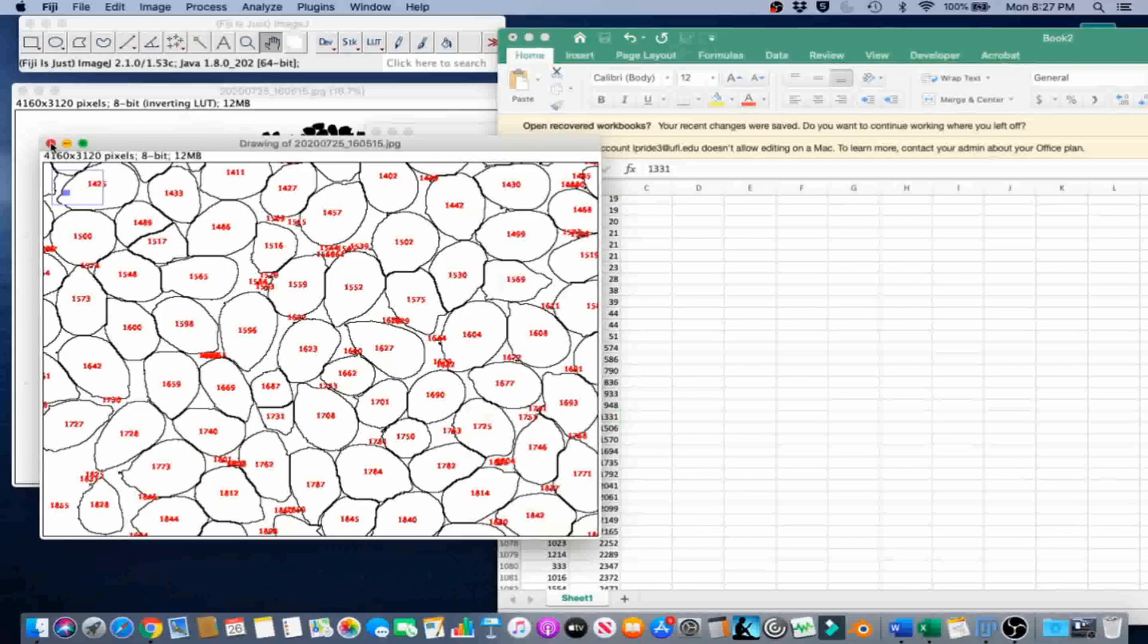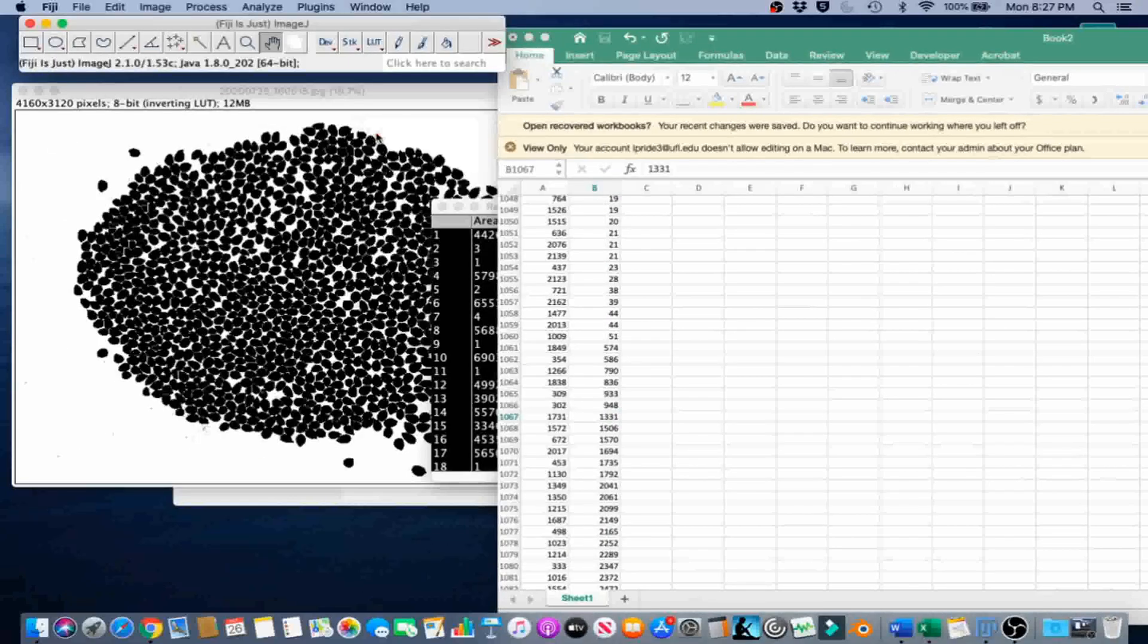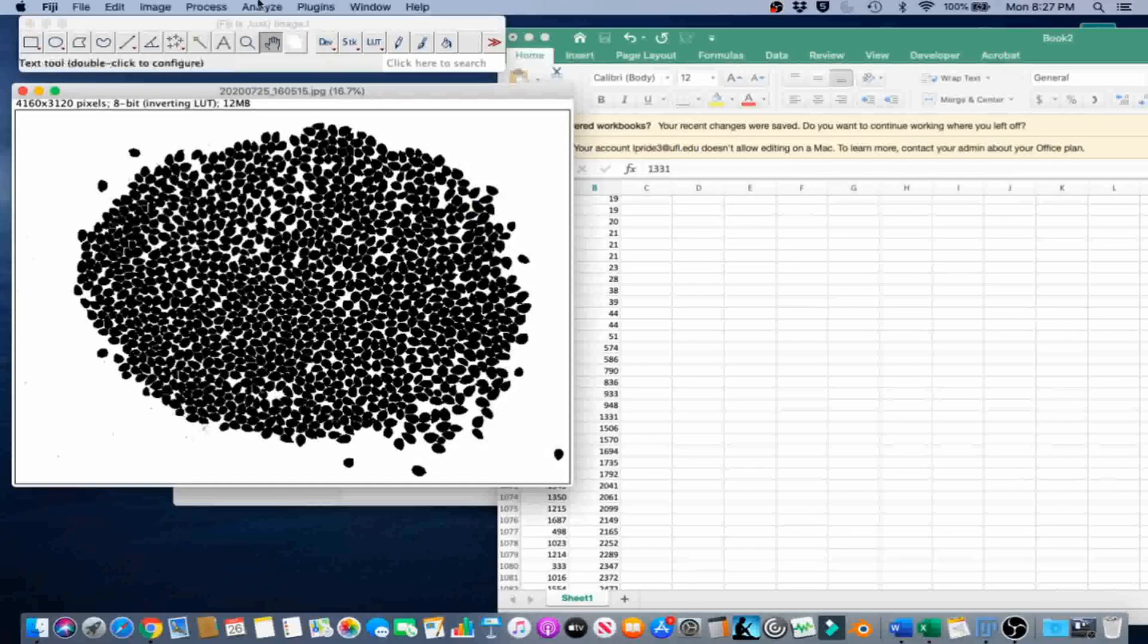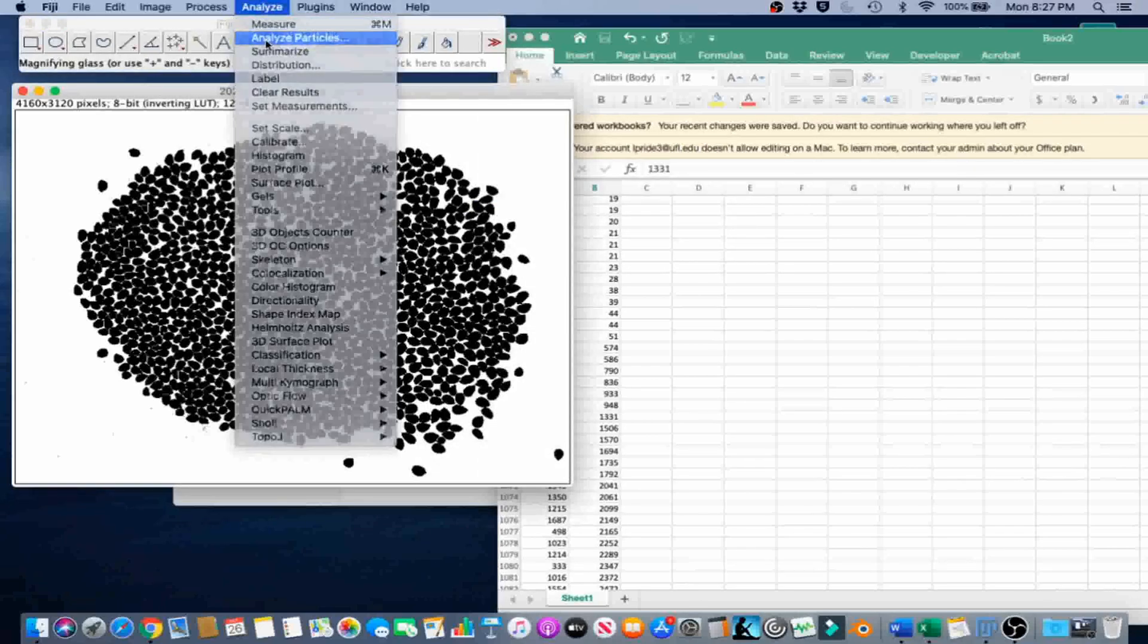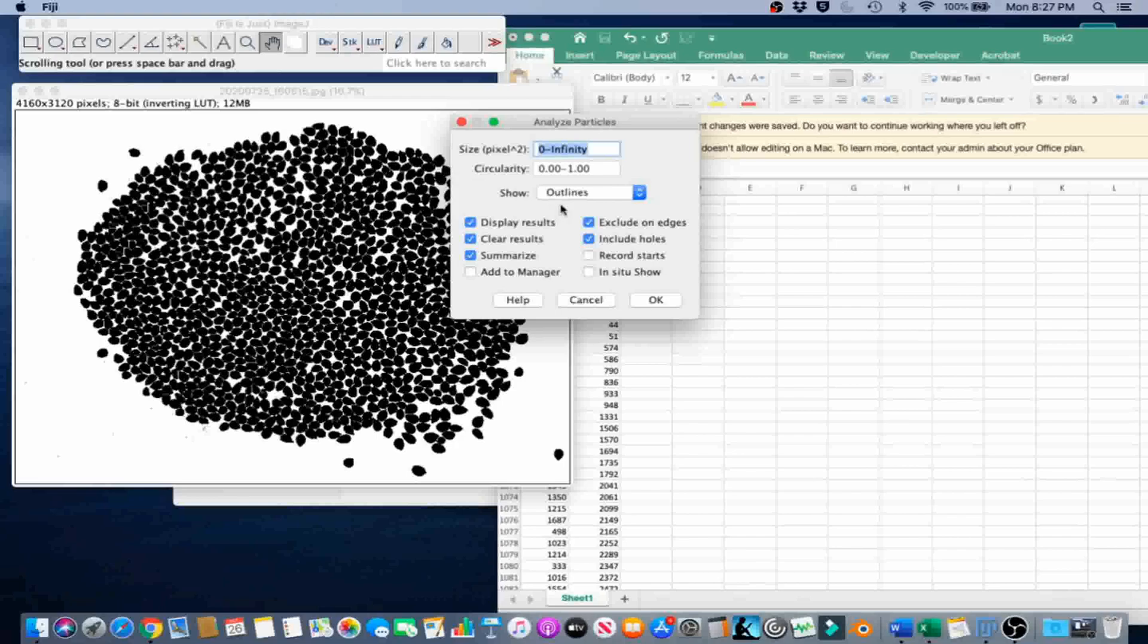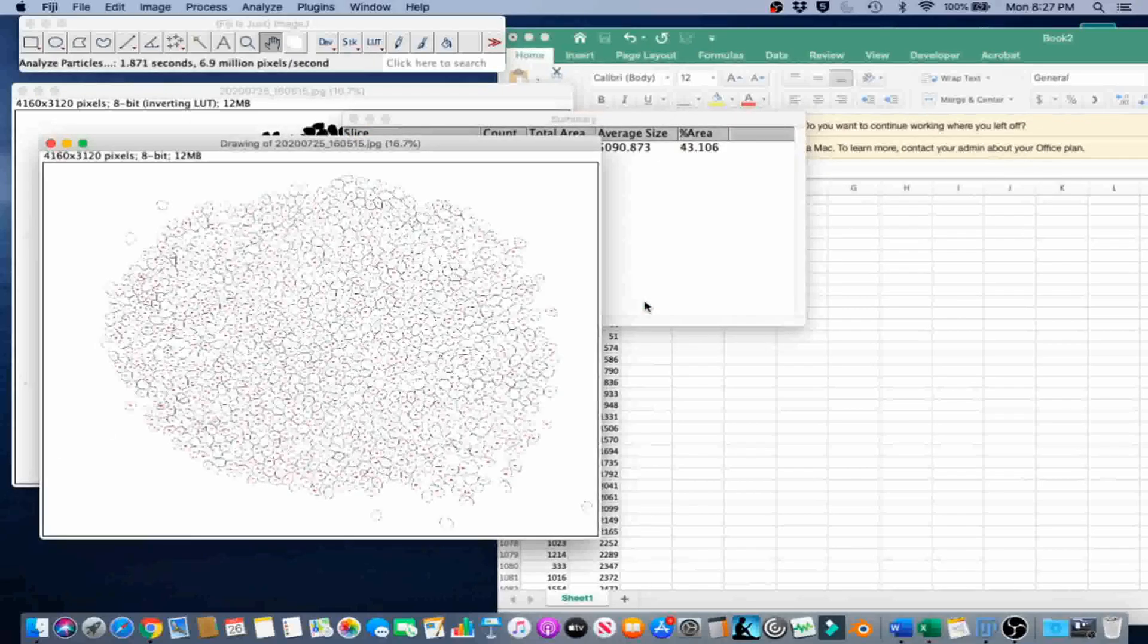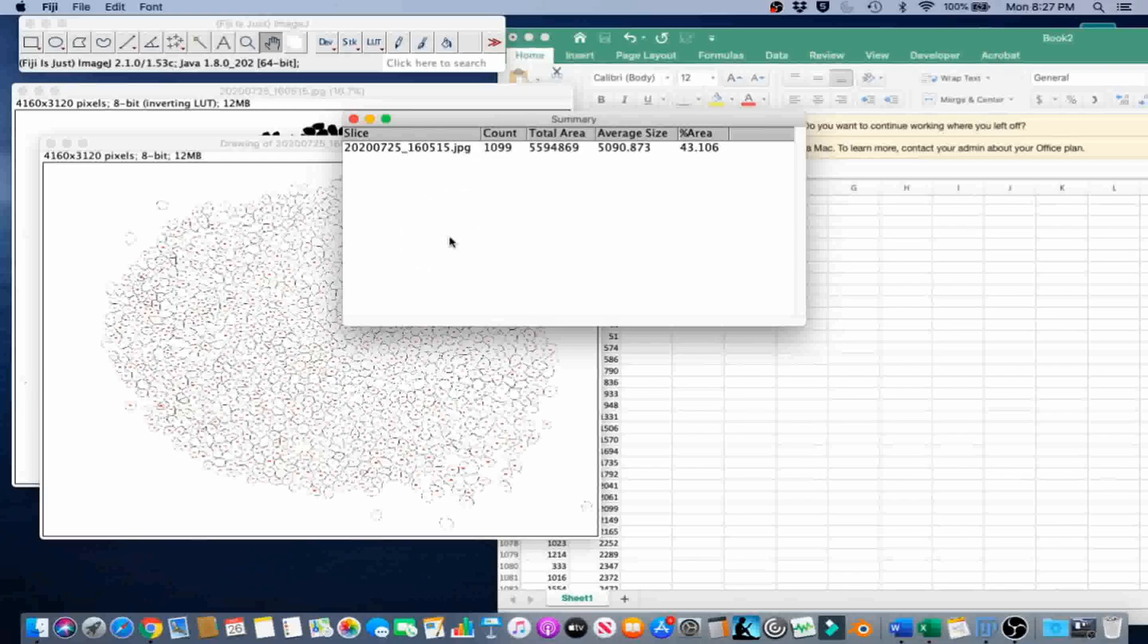Then we're going to do this again. We're going to analyze particles, size in pixels, lower value 1331. Everything else can be the same. And now, according to ImageJ, we have 1099 seeds, which seems about right, honestly.